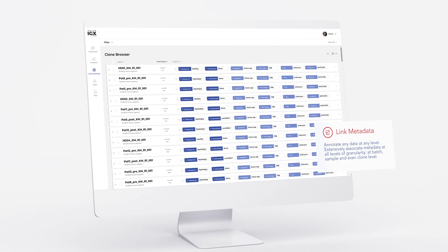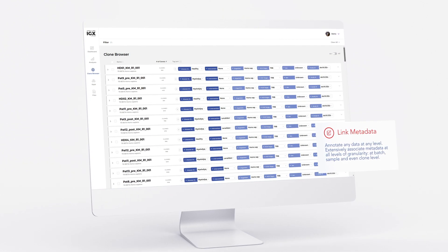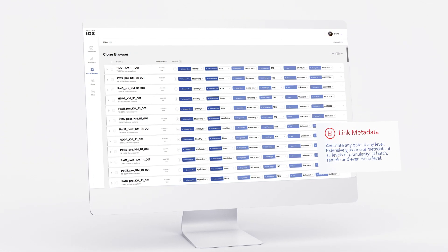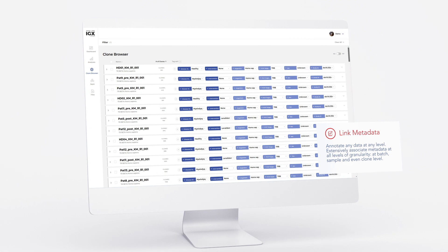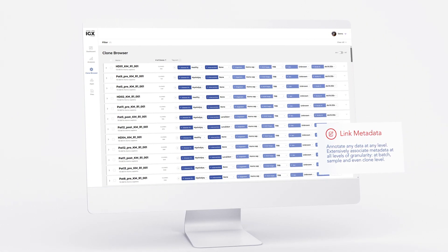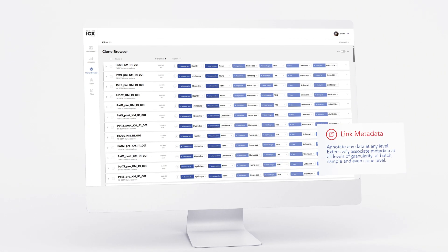Instead of using folders and files to organize your data, the IGX platform is equipped with an intuitive tagging system to annotate your sequences with any metadata you have.